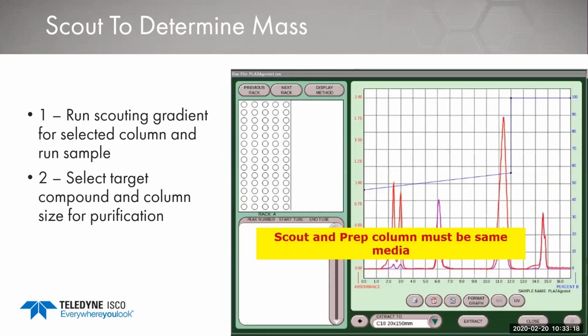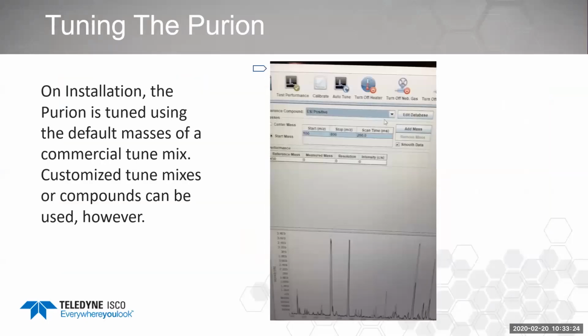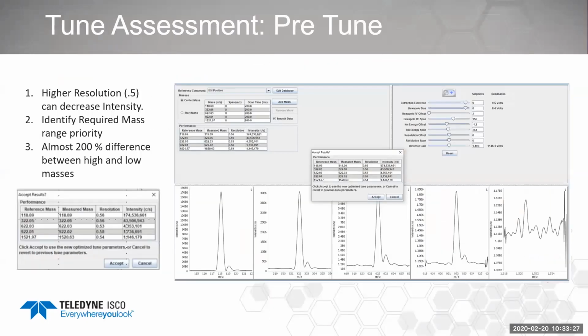So if I go back to the ionization parameters during our tune setup, if you look here closely, you'll see that we actually have a window of about maybe 10 to 15 Dalton. So suppose that your drift is so bad that you tweak it, you tweak it, you tweak it, and we're just constantly redoing the tune to the point where we can no longer have that adjustability built into the quadrupoles. At that point, what it would require is probably cleaning, would be my guess. You could have our service engineers come in and do a cleaning and help you get back to getting a good response out of that.